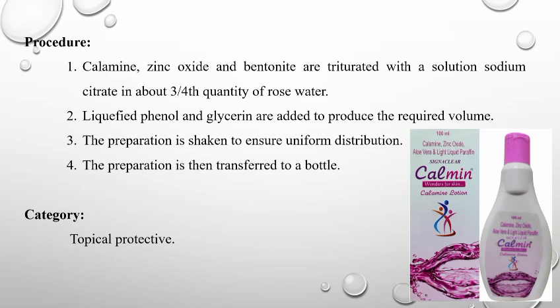On the other hand, we have to take liquefied phenol and glycerin and mix it to produce the required volume. Then we have to mix both the mixtures and shake it to ensure uniform distribution. After the preparation, both the mixtures are thoroughly mixed and the preparation is to be transferred to a bottle. Usually, these lotions act as a topical protective and also give a soothing effect.